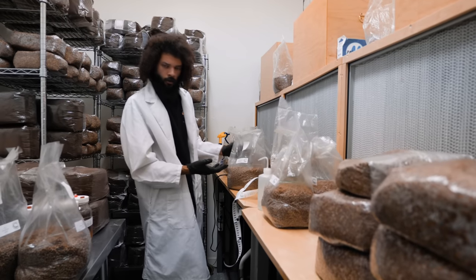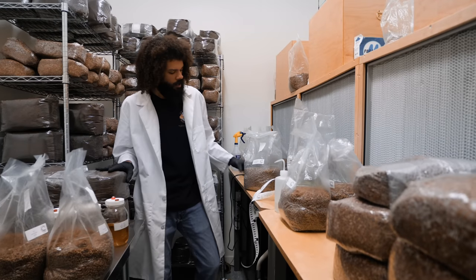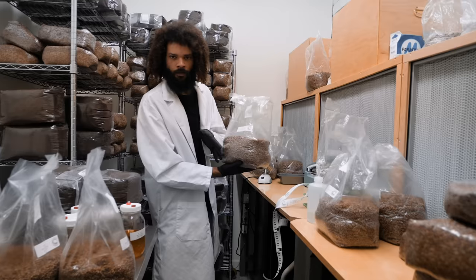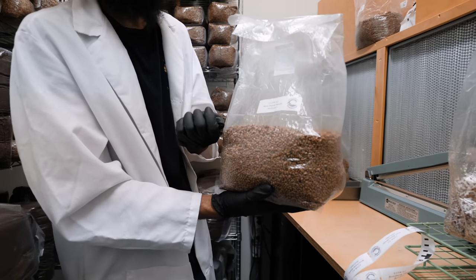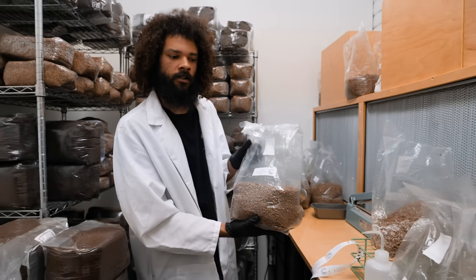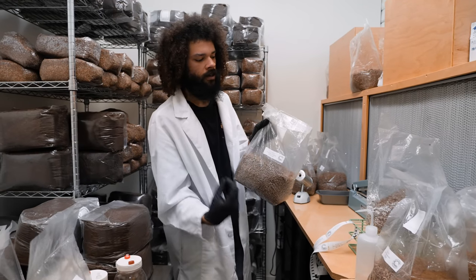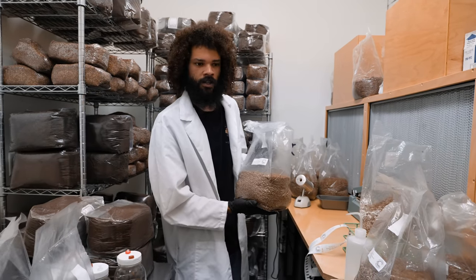Grain spawn is an important step in production — instead of going from liquid culture or straight from a petri dish into a sawdust production block, we prefer to go grain spawn to production block. With grain spawn, you get more inoculation points: each individual kernel becomes a vehicle to carry mycelium into your sterilized substrate. With just a small handful of grains, you get a hundred or so inoculation points, which really speeds up the colonization process. The added nutrients from the grain spawn — certain nitrogen benefits, starches, and sugars — also help boost yields and production.